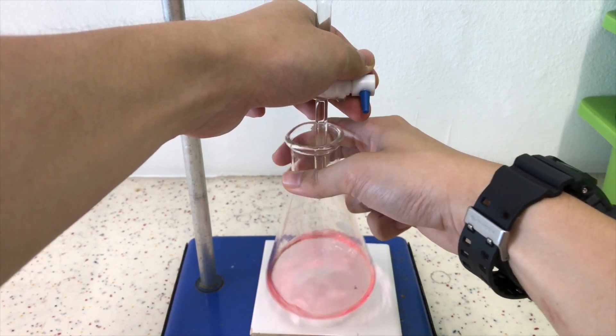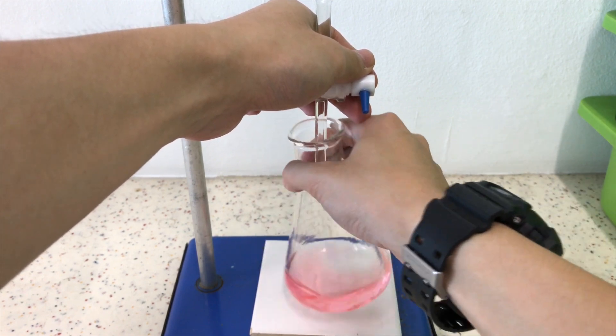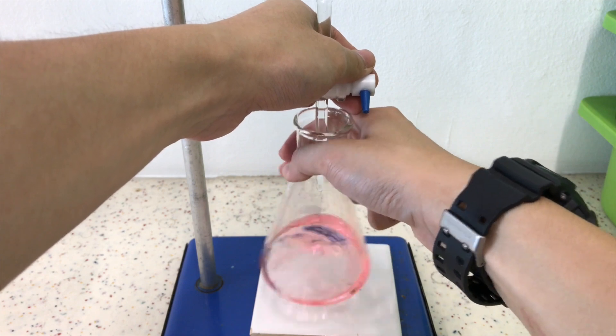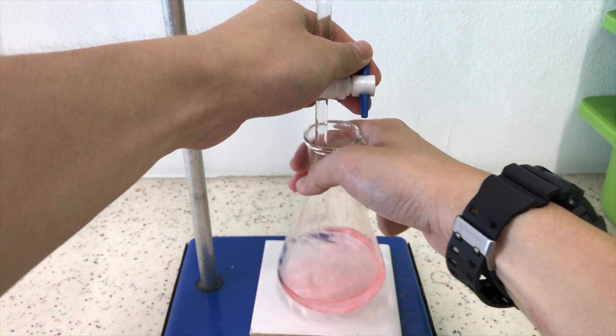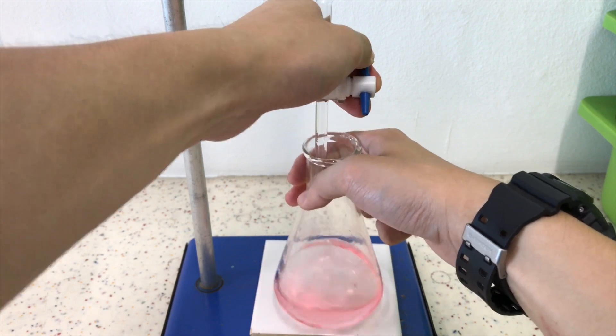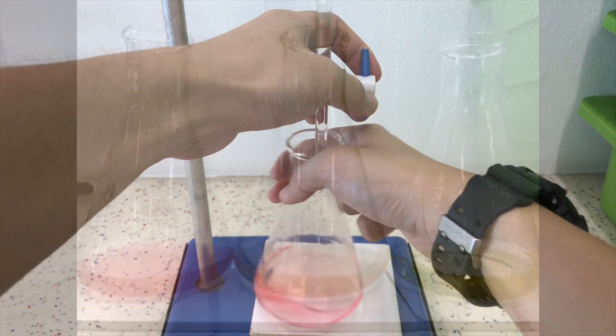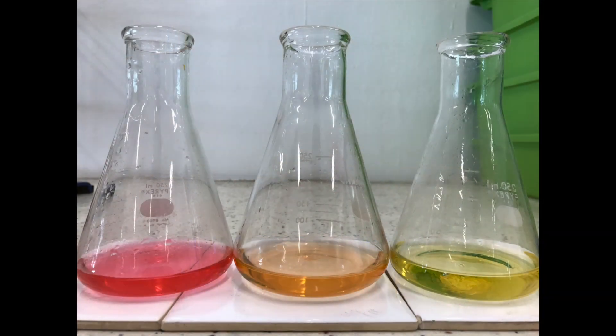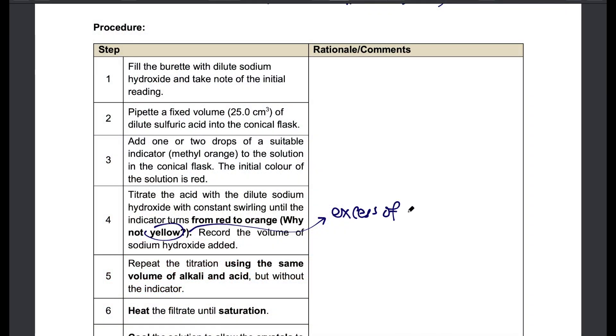Instead of what I did just now which is just to pour one solution into the other, we will do a titration in which we will add the alkali from a burette so we can control it very carefully with dropwise addition using the tap. Add it until the indicator changes color. We will stop when the indicator changes from red to orange because that's just nice complete neutralization. If it's yellow that means the pH has gone up too high and you have added an excess of alkali.